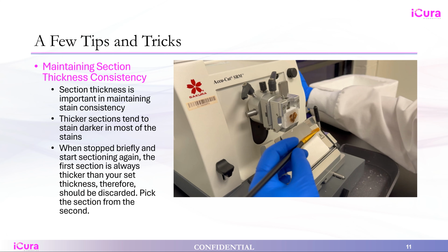And what we have seen is that whenever you stop sectioning a block, maybe you want to take a break, or you're just taking the first ribbon into the water bath and coming back to the block to start the next ribbon, the first section coming off the next ribbon is normally much thicker than the sections coming after that in the same ribbon.